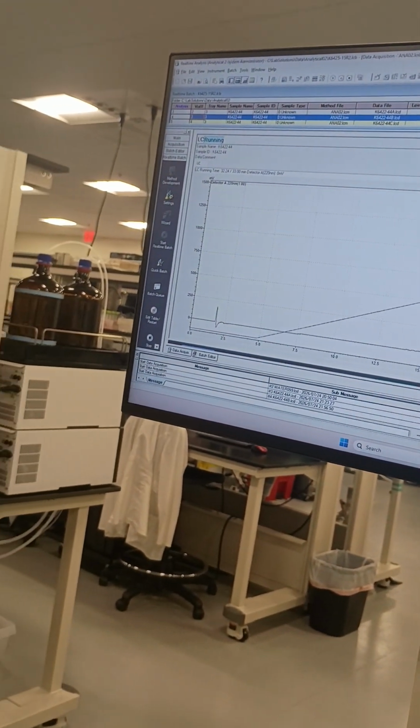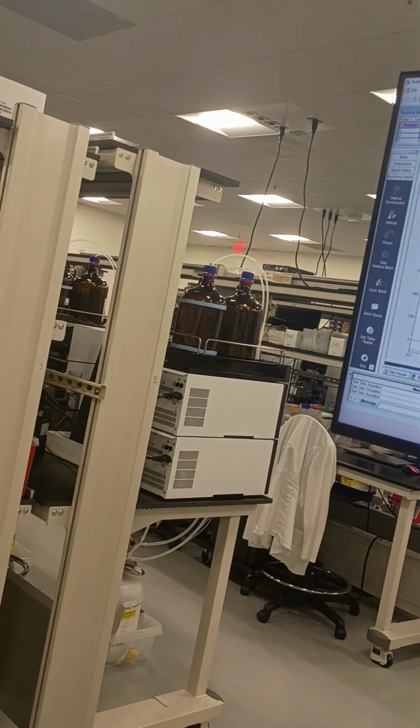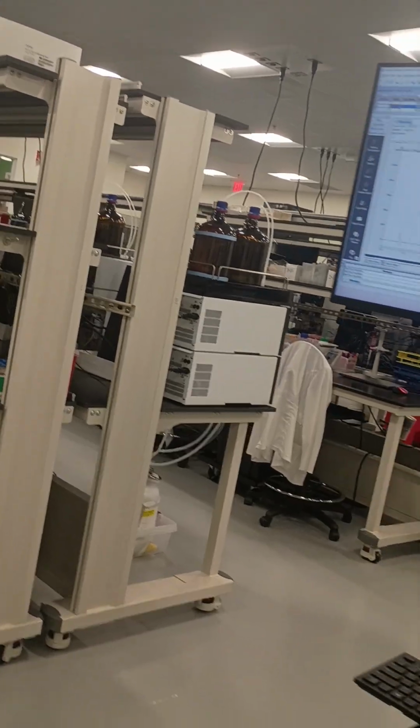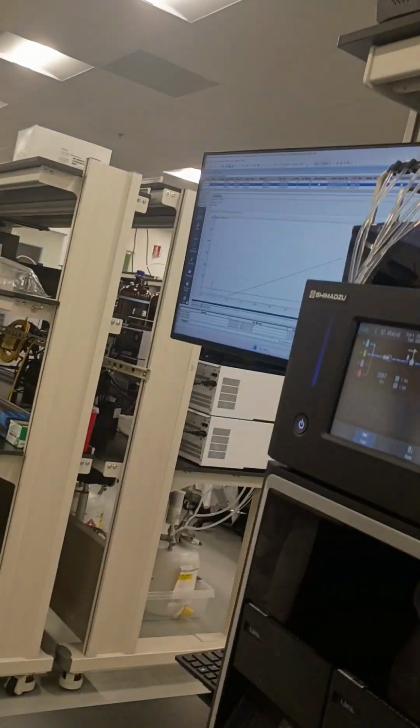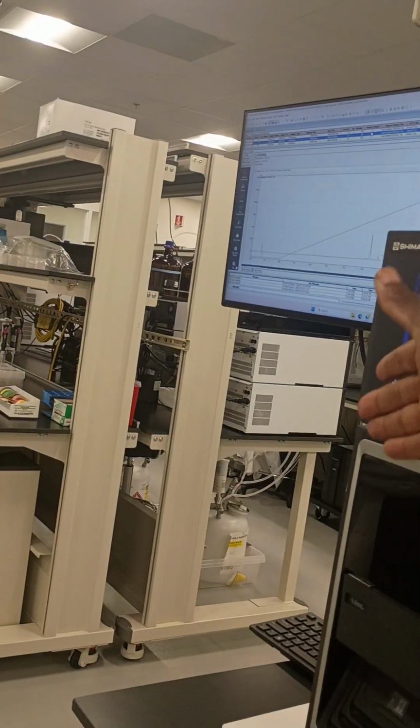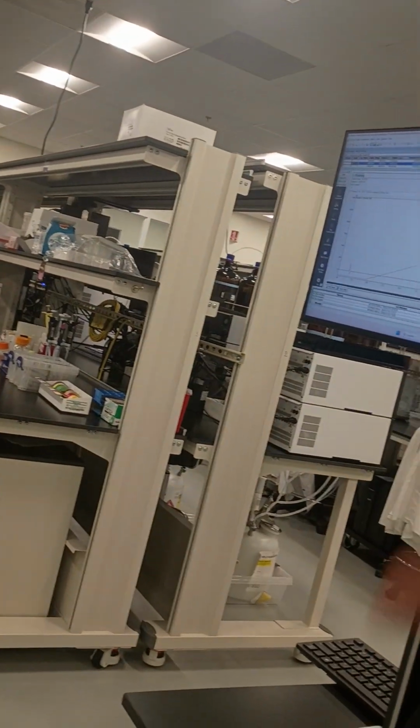If you do a single shutdown, it's going to turn just the lamp off, and the pump is still going to be running. So if you come around and you hear that click, and it's red, orange, but you hear that click, that means the pump is still running. You have to go ahead and shut it down.